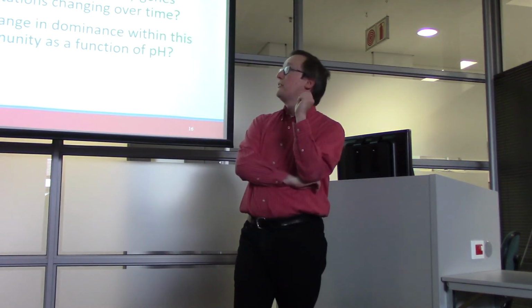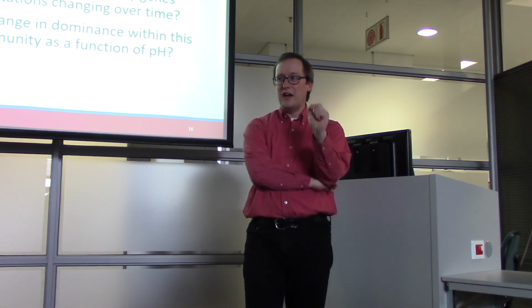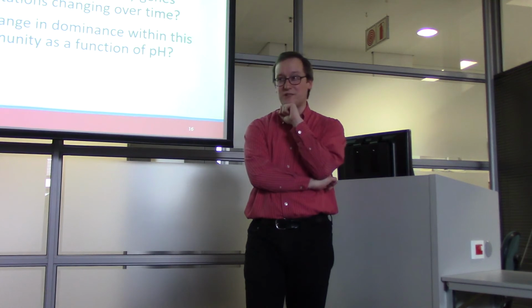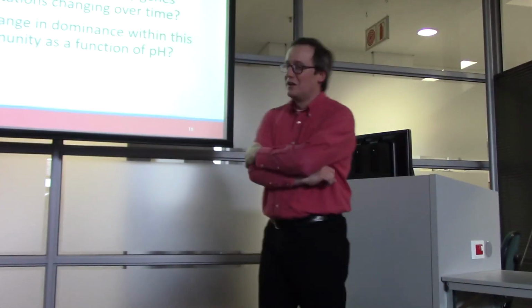I wanted to give you 3 examples where amplicon sequencing was valuable for quantitative exercises. Okay? So I'm going to start with tuberculotic sputum, right? Somebody has developed tuberculosis, and we want to know what variant of critter they've got growing in their lungs.